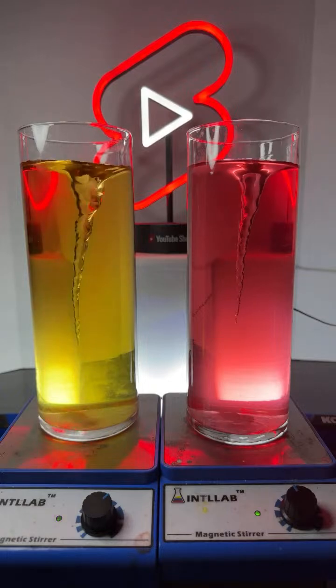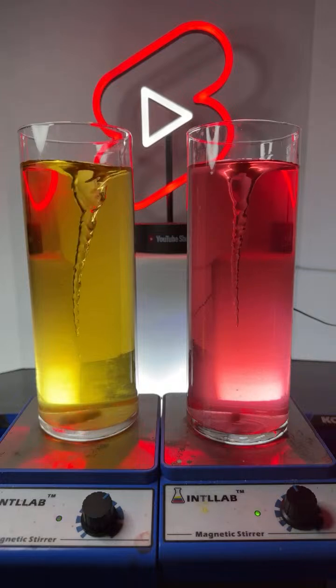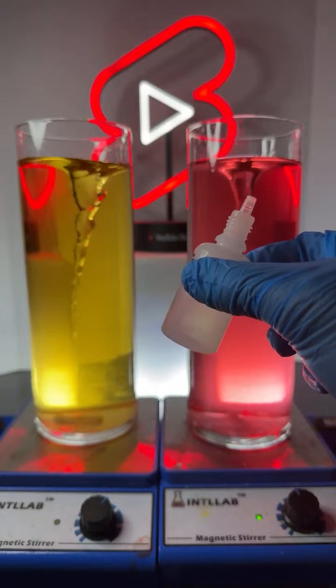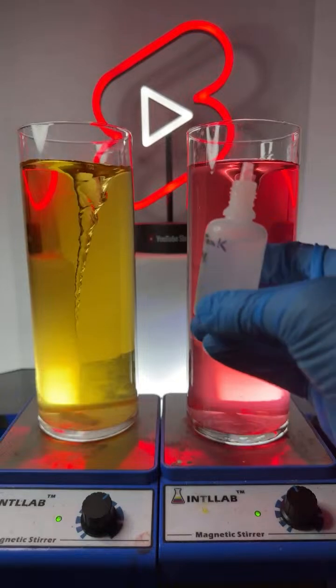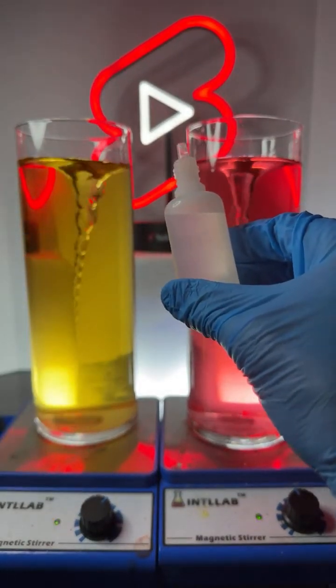Is there any acid with 0 pH, asks JSR. Yes. In fact, this acid that I'm adding has a pH that's lower than 0. Thank you there, John. I appreciate that. So yeah, this would probably have like a pH of 0 or something like that.